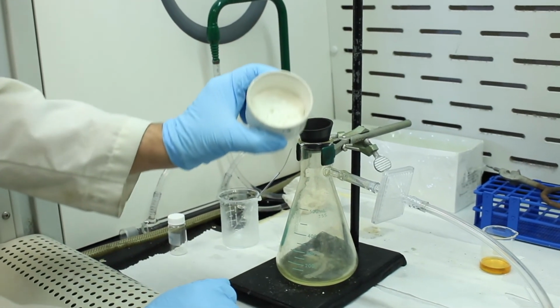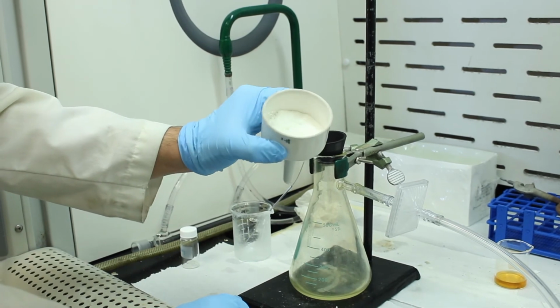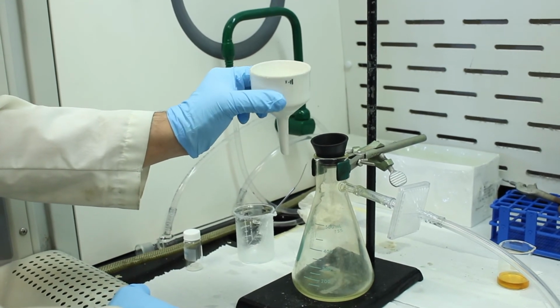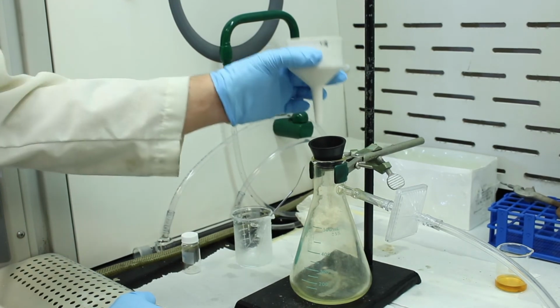Okay, as you can see, the product is a nice white powder, so that's a good indication that we're fairly pure here. And then the filtrate here, which is hexane, should have the biphenyl impurity. Okay, so we'll get this onto a filter paper and then transfer it to a scintillation vial.